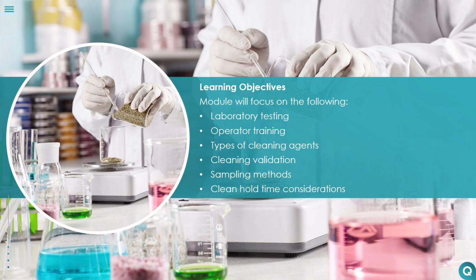In today's session, we will cover laboratory testing for material compatibility and cleaning agent selection, operator training, the types of cleaning agents, cleaning validation, sampling methods, and clean hold time considerations.